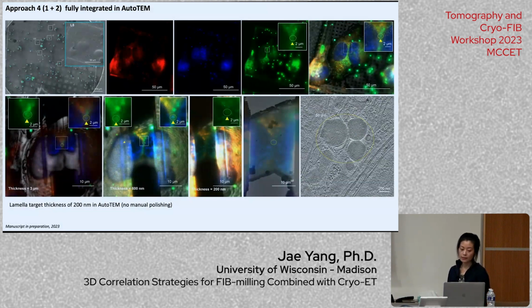This whole process is fully integrated in AutoTEM, as you saw yesterday, because you need to do the registration, pick the targets, and then go through the whole process.